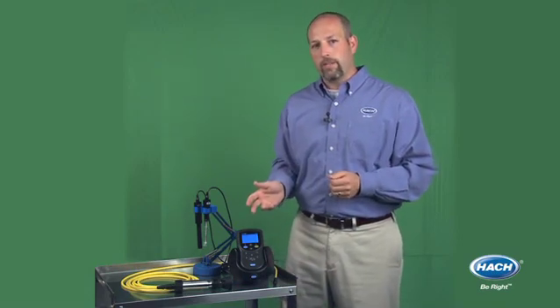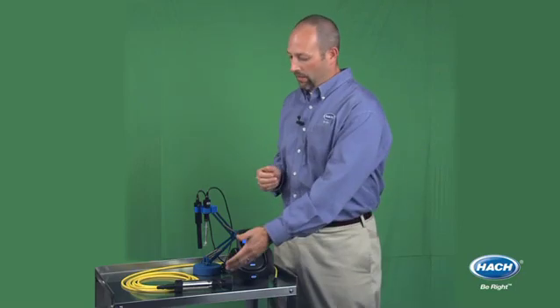This is the HQ40D meter and several of the Hock IntelliCal probes. This is a unique digital system that provides you with a number of time-saving benefits. Hock was the first and still one of the only manufacturers to offer a complete line of digital probes and electrodes.